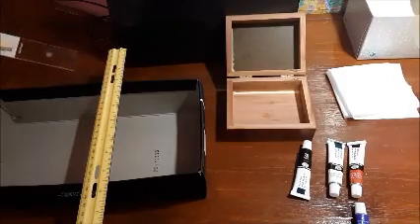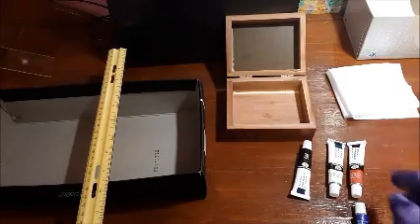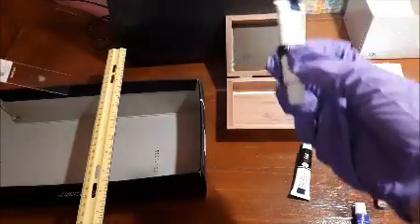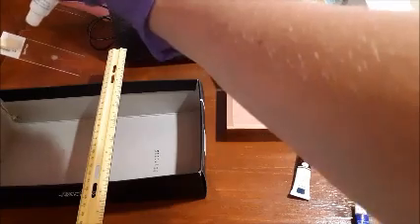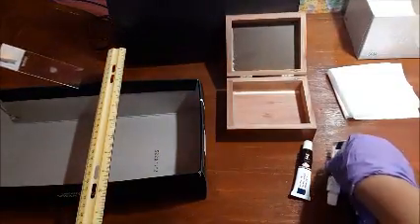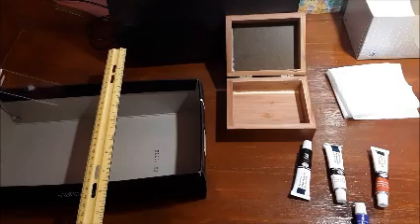Now, while still holding your slide, you're going to apply 10 to 15 drops of your 95% ethanol to your slide. This is going to act as your decolorizer. Make sure that you don't apply the ethanol directly to the smear. Just allow it to run down it. And once you've put drops there, you can put that down.